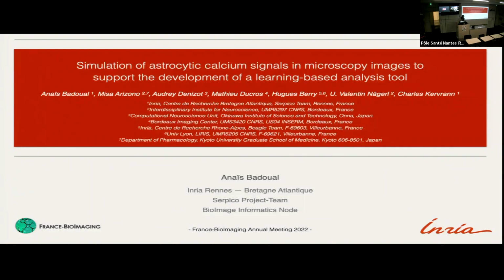So, hello everyone. Can you hear me? Okay. So thanks for the introduction and for the invitation. In this talk, I'm going to present a framework to generate synthetic data that simulate astrocytic activity. And the goal is to support the development of a learning-based analysis tool.